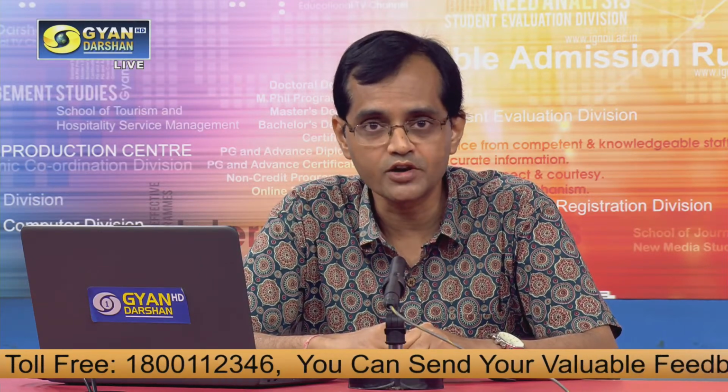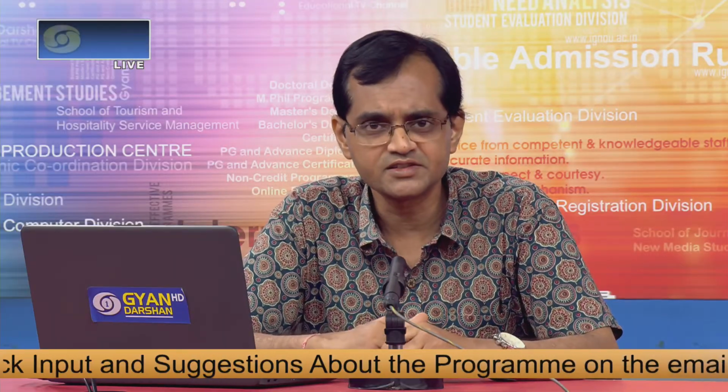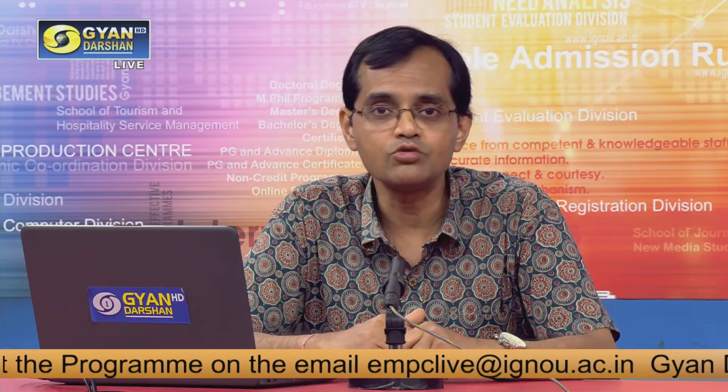Or let's say you are doing some genetic engineering. You are cloning a particular gene, and then you are integrating the gene within the genome of a plant or an animal. So you need to know whether the gene has been incorporated within the genome. For that, you have to again isolate the genomic DNA. There are many other reasons, but these are some of the prime reasons for which you have to know how to isolate the genomic DNA.